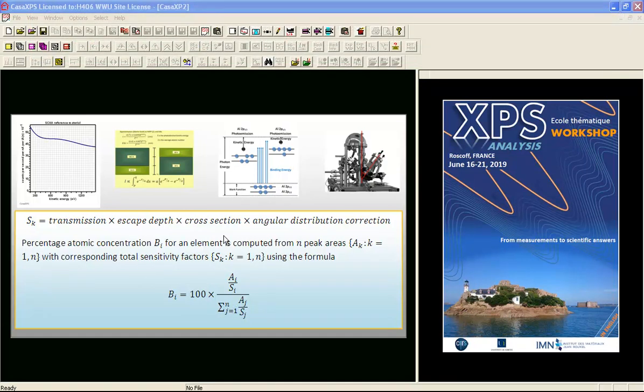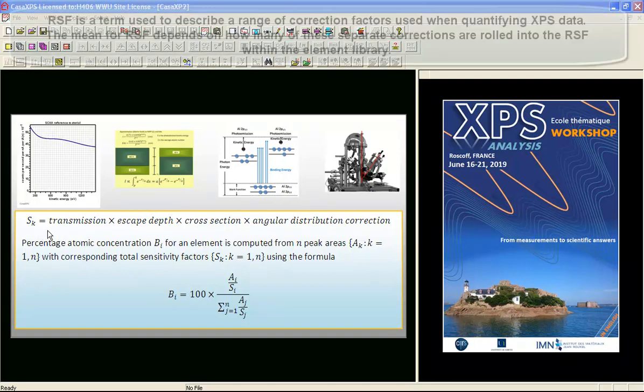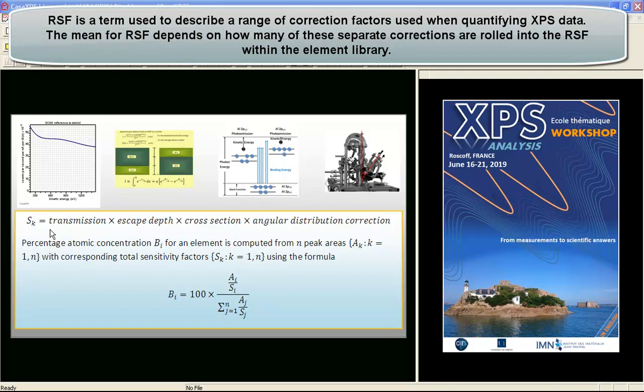An element library tabulates for each photo emission peak a sensitivity factor or relative sensitivity factor. In the case of Schofield, the library simply contains the cross section. Then we have to calculate the transmission function, the escape depth, and the angular distribution correction in order to perform this calculation of atomic concentration.